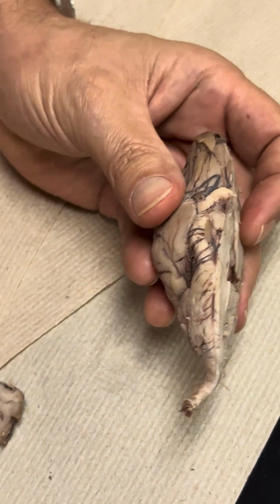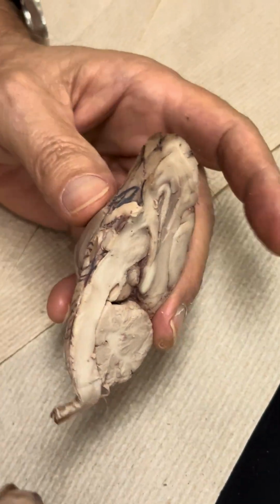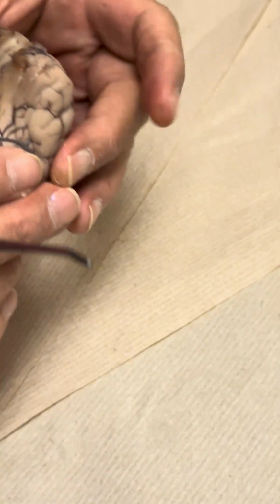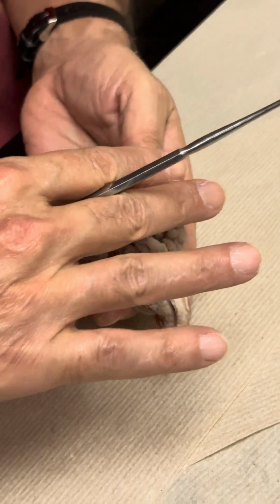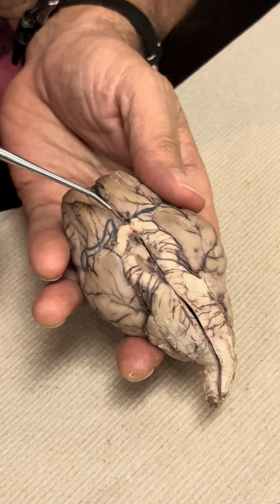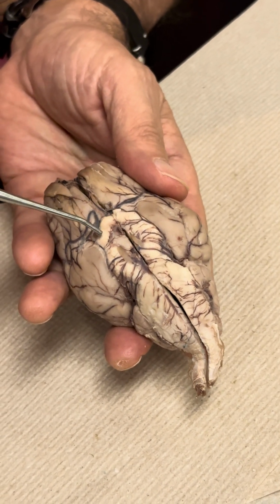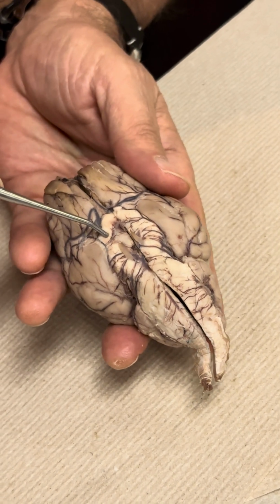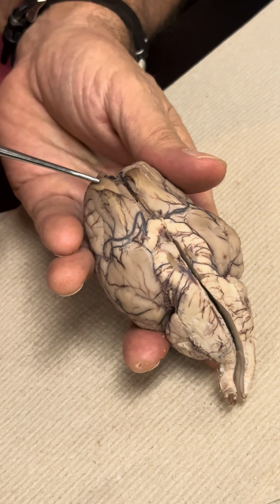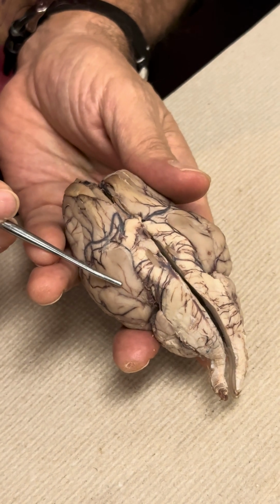All right, so that brings us then to this column of white matter, which forms a V shape. So let's look at it here. Optic nerve, optic chiasm, optic tract, olfactory bulb, olfactory tract, olfactory cortex.